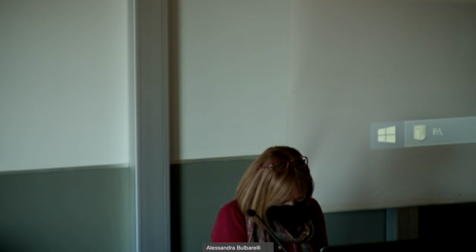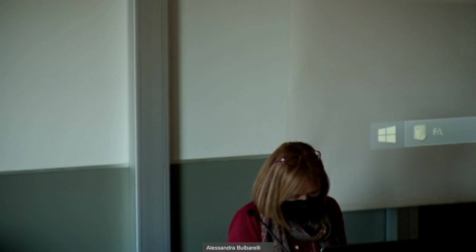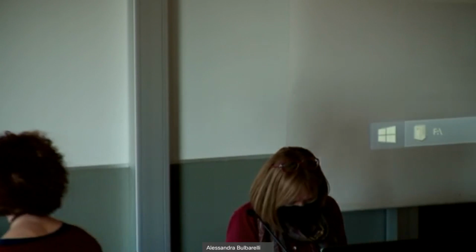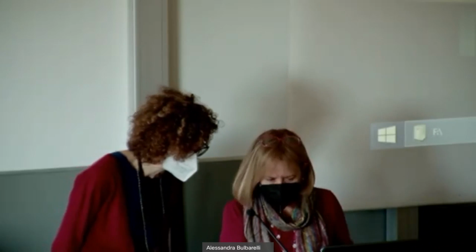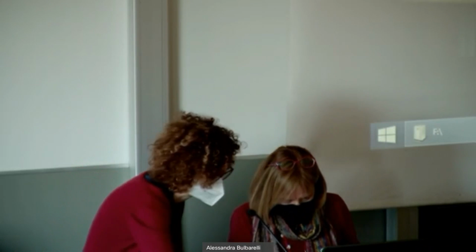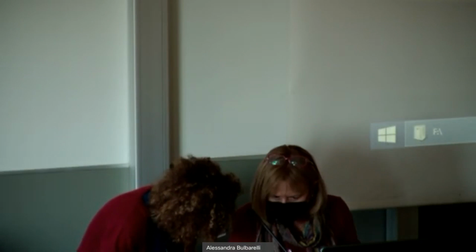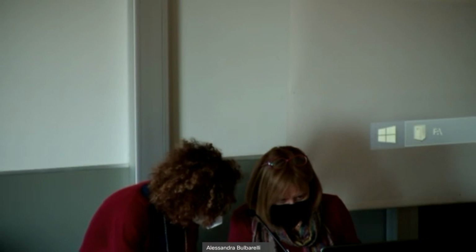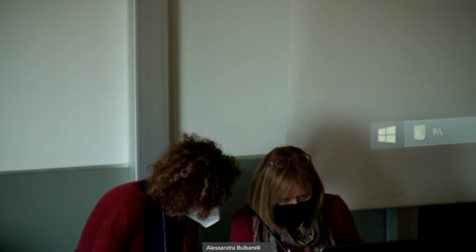Yeah, the number of images and areas here is certainly very small to be able to train a software. It was just the first project. But certainly if we add a lot of images, say in these statistical things more than 1,000, it would be at least a better starting point.